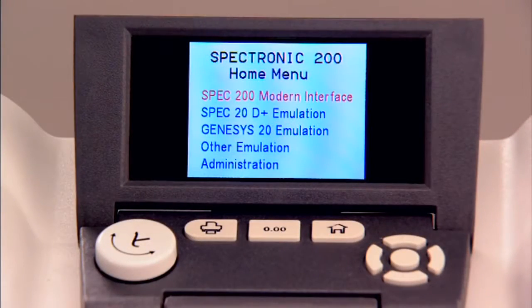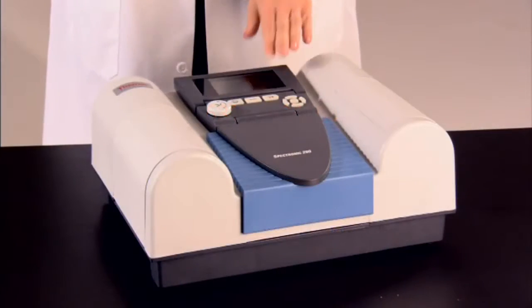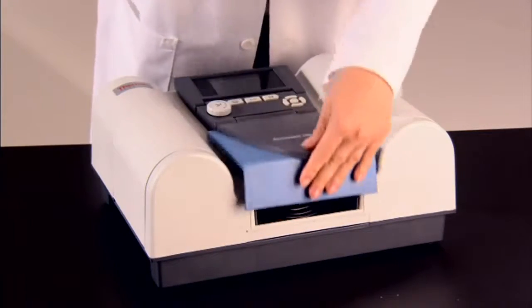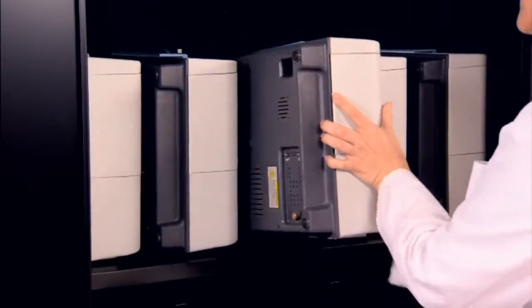If the SPEC 200 shares a lab with older spectrophotometers, it can emulate them so that your students can use the same protocols, no matter which instrument they're working with. The Thermo Scientific Spectronic 200 — with the experience gained from over a half million SPEC 20 customers, the SPEC 200 will become the new standard of the 21st century teaching lab.